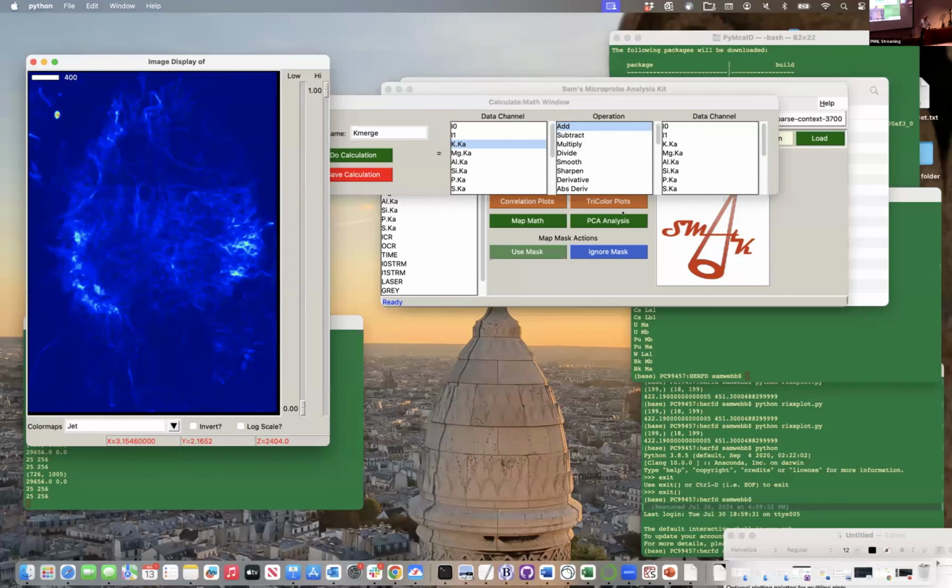Font size? Again, it's also the default view here. So what I often do is export it with this, and then I'll come in with a text bubble and make it bigger for a publication if it's too small. We have a question two rows back there.